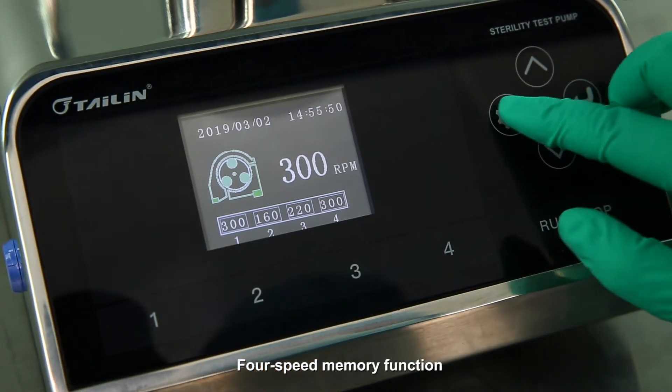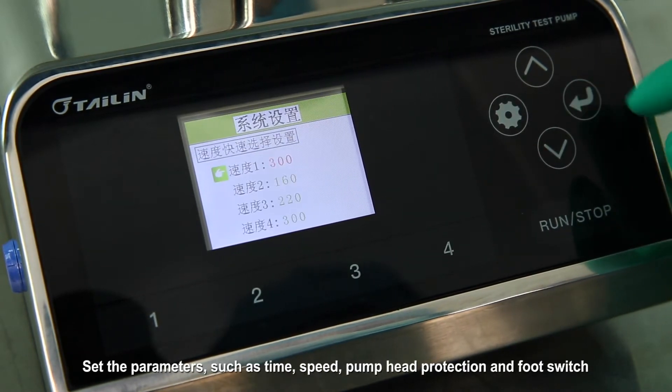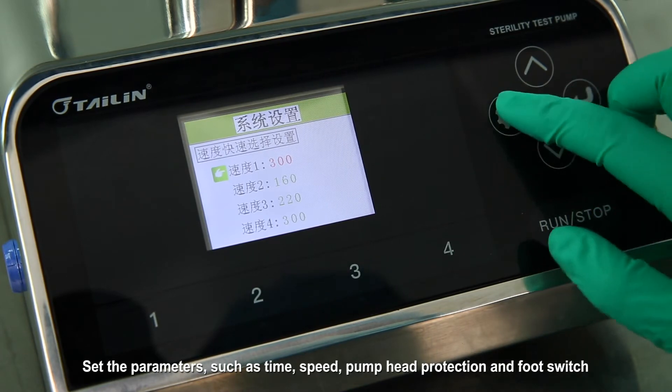Four-speed memory function, set the parameters such as time, speed, pump head protection, and foot switch.